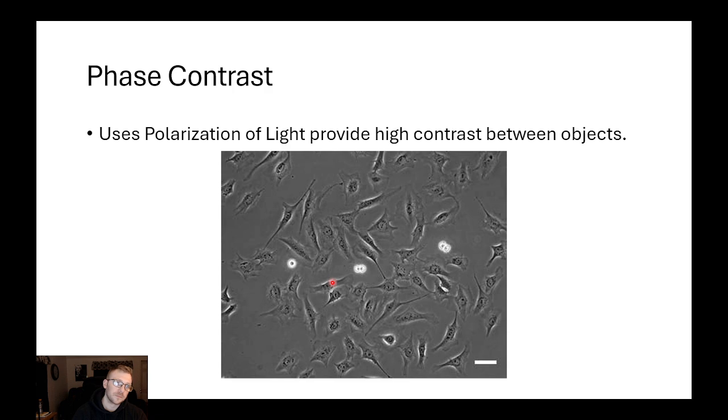contrast. Phase contrast is also really useful if you're just trying to look at something quickly and you don't want to have to scan through everything on your slide at a really high objective. You can usually just look real quick at your stuff and see things easily. It's also really useful for things like wound healing assays, where you don't care about much of the intercellular mechanisms, but you want to see how the cells function as a collective. Phase contrast can be a really powerful tool for looking at cells in bulk.